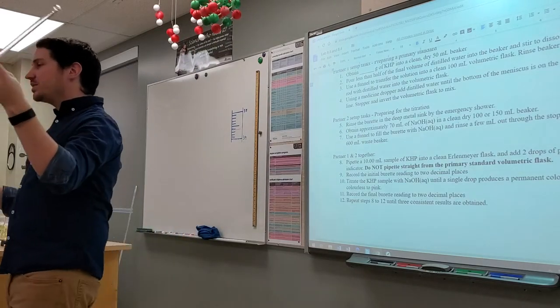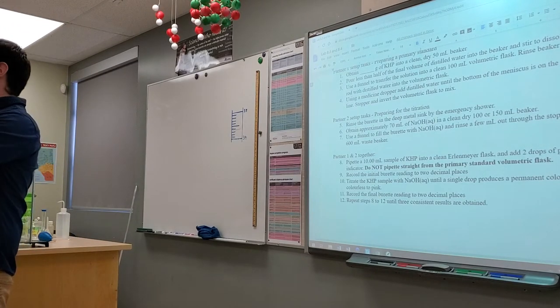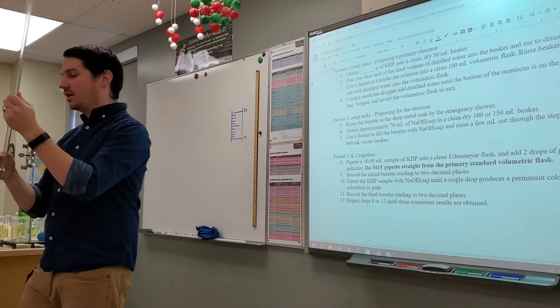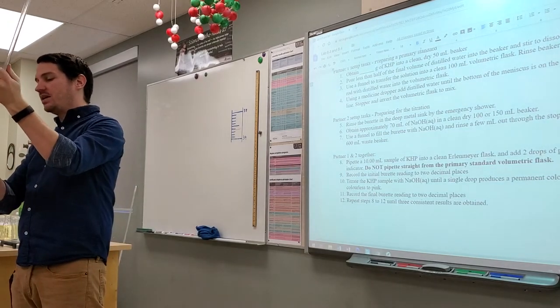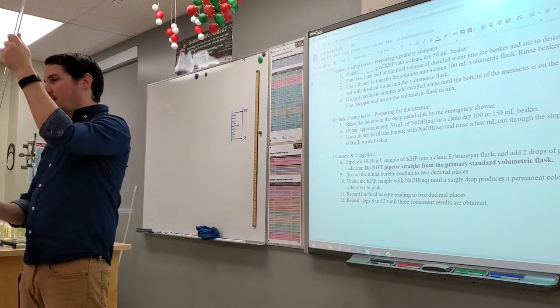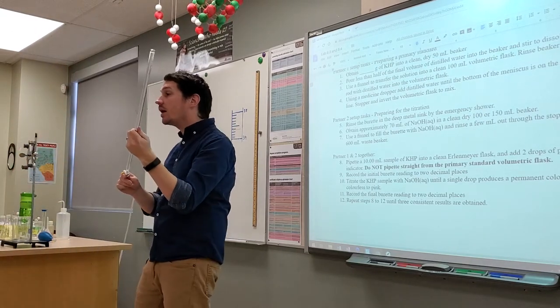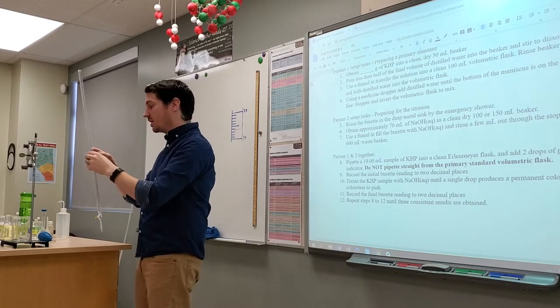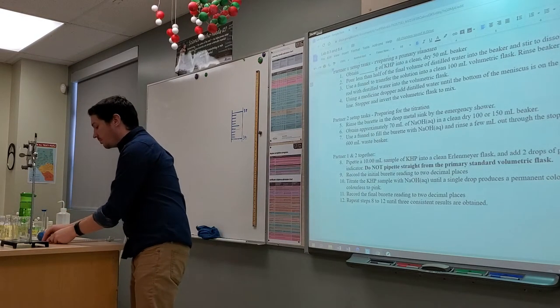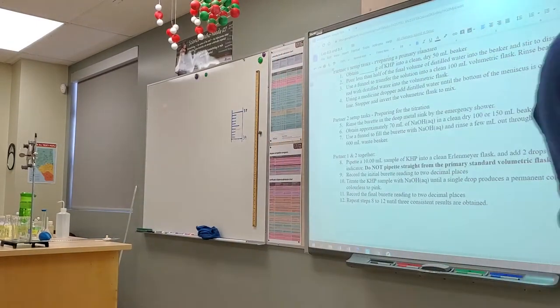Now, most of you probably won't use the yellow stopcocks because they don't have a threaded adapter on them. This one just pops in, and what happens if you put too much downward force on it? It pops out, right? So most of us probably won't use it, but if we run out, we'll have to resort to these. Whatever, that's totally fine. Most of us will probably use this.